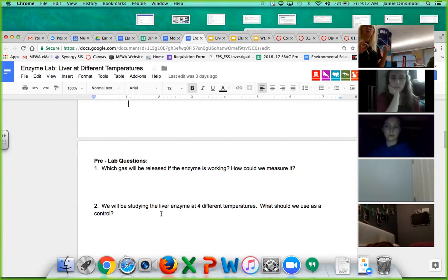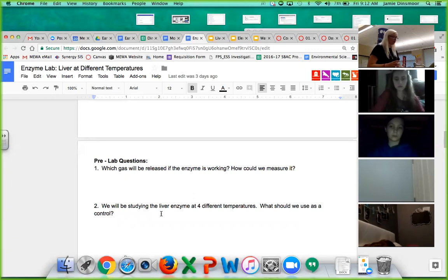We're gonna have ice cold in our ice. We're gonna have room temperature. We're gonna have body temperature, which is gonna be as close to 98 degrees as we can get it. And then we're also going to have boiling, right, or 100 degrees Celsius. So part of this is gonna be you guys predicting which one of these situations you think is actually going to be the best for the reaction. How are we going to get the most bubbles?